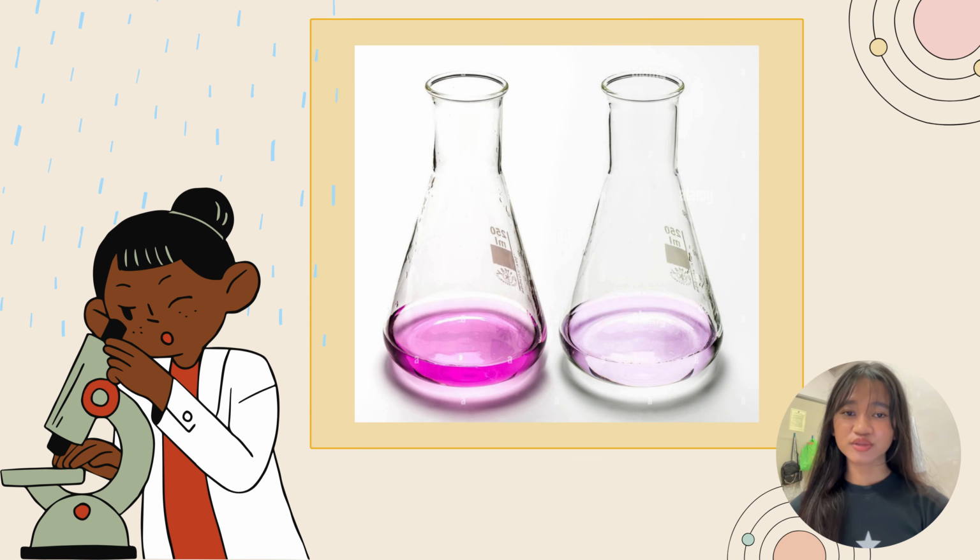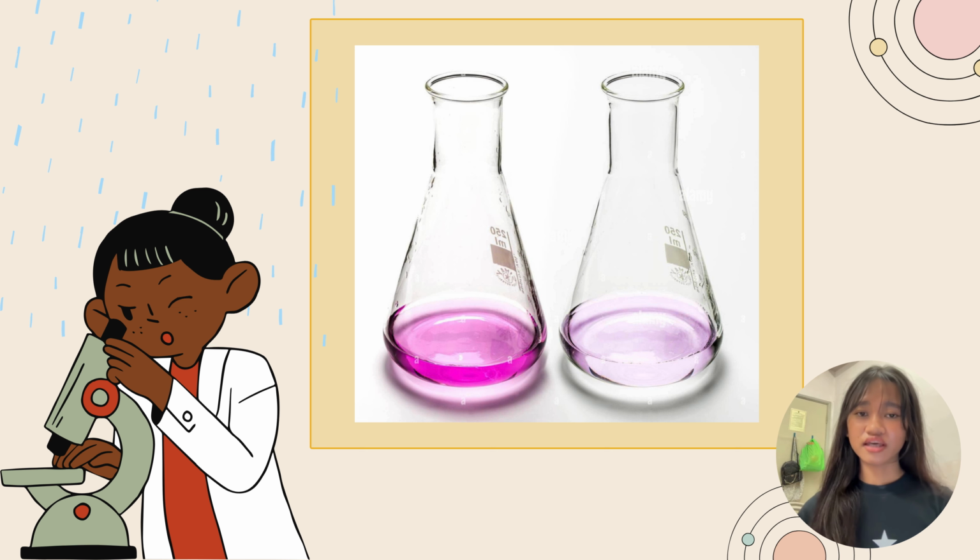And this is the expected result of the titration. As you can see, the solution turned pale pink. This means that the solution has reached the equivalence point.